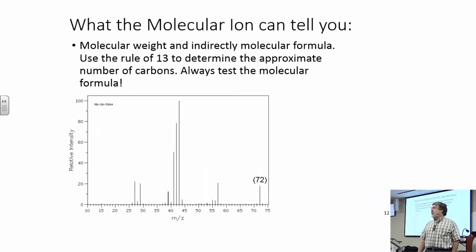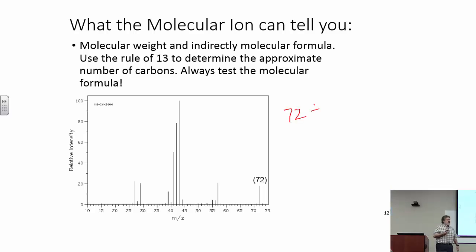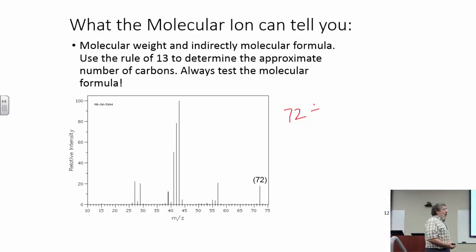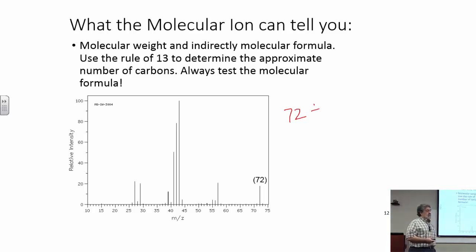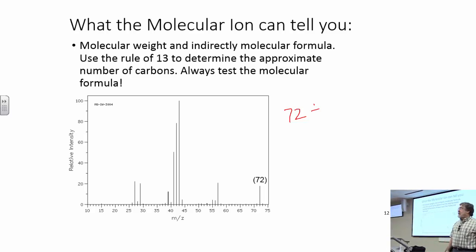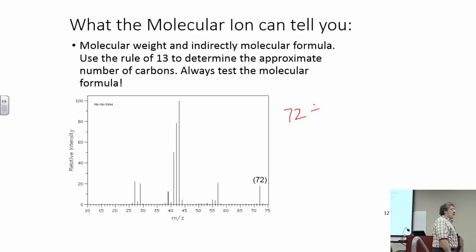5.876? Making that up, of course. I don't know what the points are. So you do the division, you get 5. 5 must be the number of carbons that the molecule contains. What else is present? Well, 5 carbons really accounts for how much of the molecular mass then? What's 5 times 12? Come on, guys. It's only Monday. 60, thank you. And the balance then is 72 minus 60 is 12. So what's the molecular formula of this molecule?